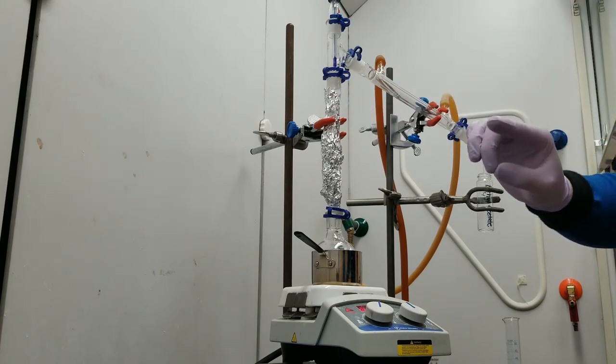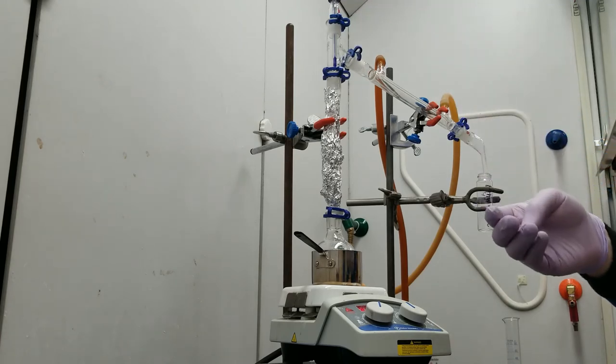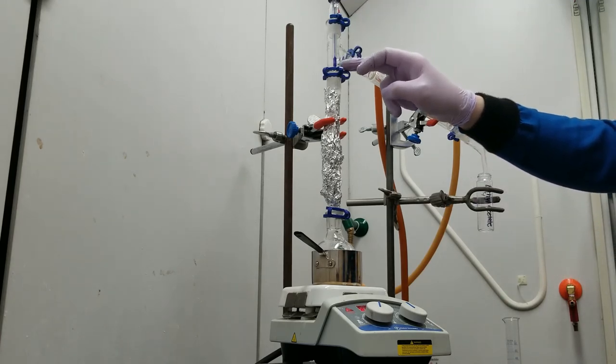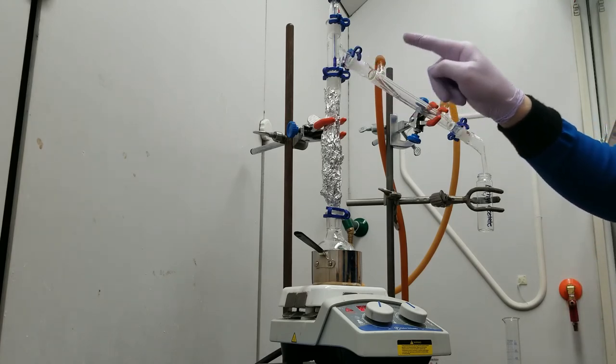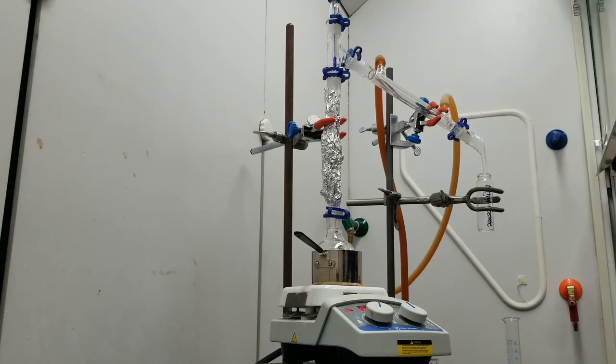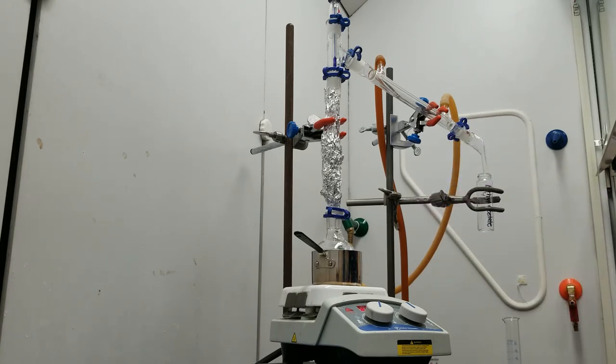And then what I'm gonna be looking for is for my thermometer reading to start increasing, because the fumes are going to start hitting the thermometer bulb. And that's when I know that the fumes are right here and they are just about ready to be collected. Now, that heating step is going to take 20 or 30 minutes. It's going to be a little while.